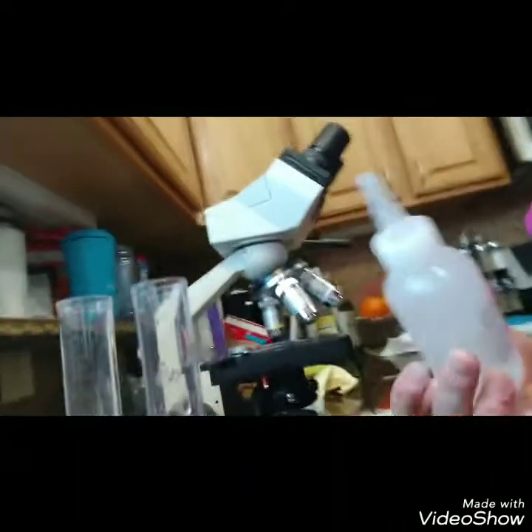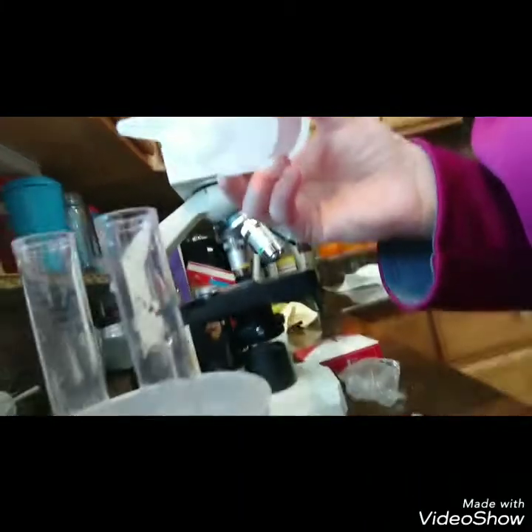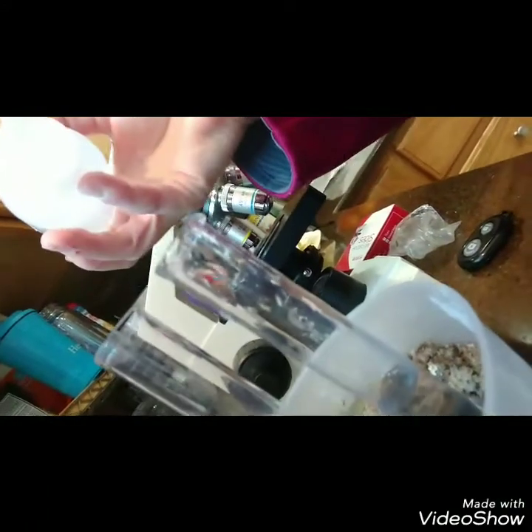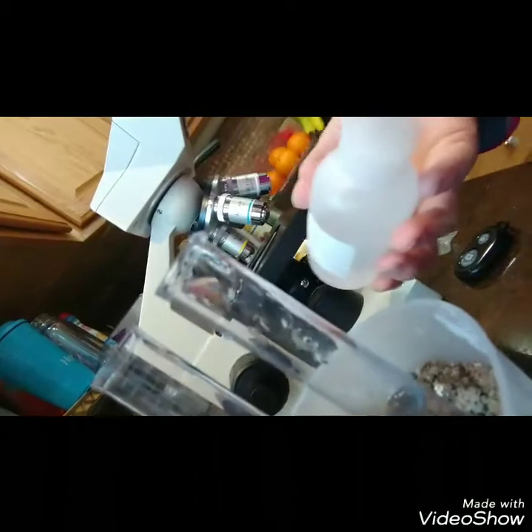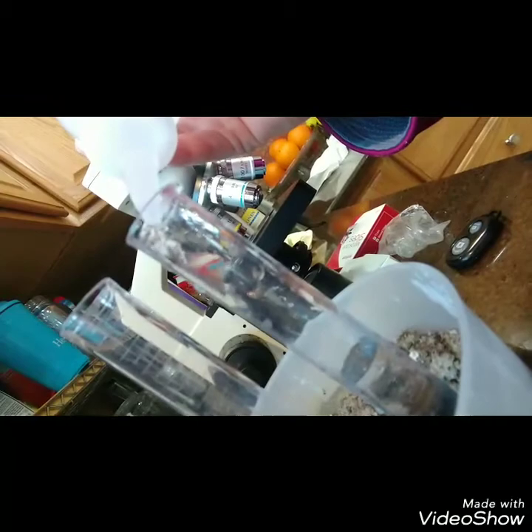So what you're going to do first of all is take your solution and fill it about an inch up on the bottom. When I first started doing this, I was just squirting the solution right in the center — and I don't have a lot of patience, so I was squirting really fast. That creates a lot of bubbles. So what I do now is squirt it slowly against the side of the test tube. Works a lot better.